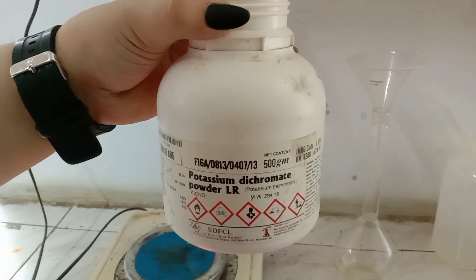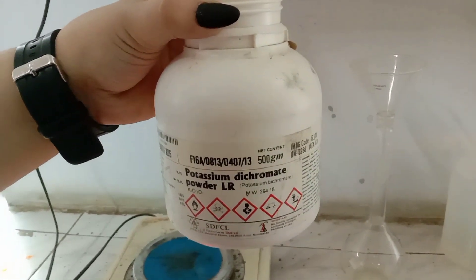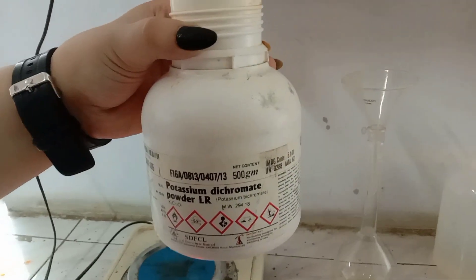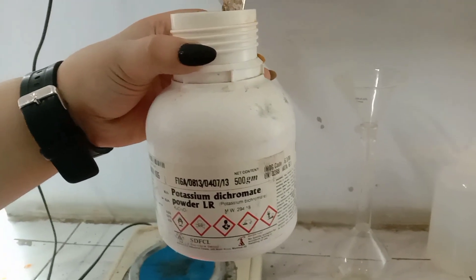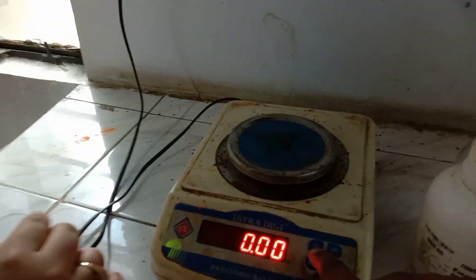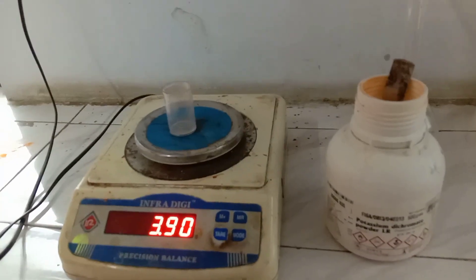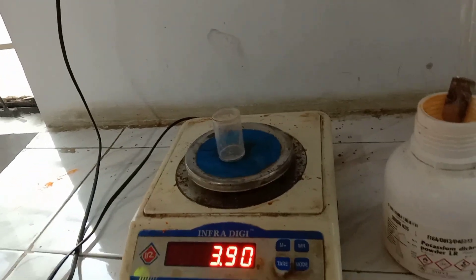For the estimation of Cu²⁺ ions, the primary standard substance taken is potassium dichromate, formula K₂Cr₂O₇. To begin the experiment, we need to weigh the empty weighing bottle. Note down the weight of the empty weighing bottle: 3.90 grams, W1.